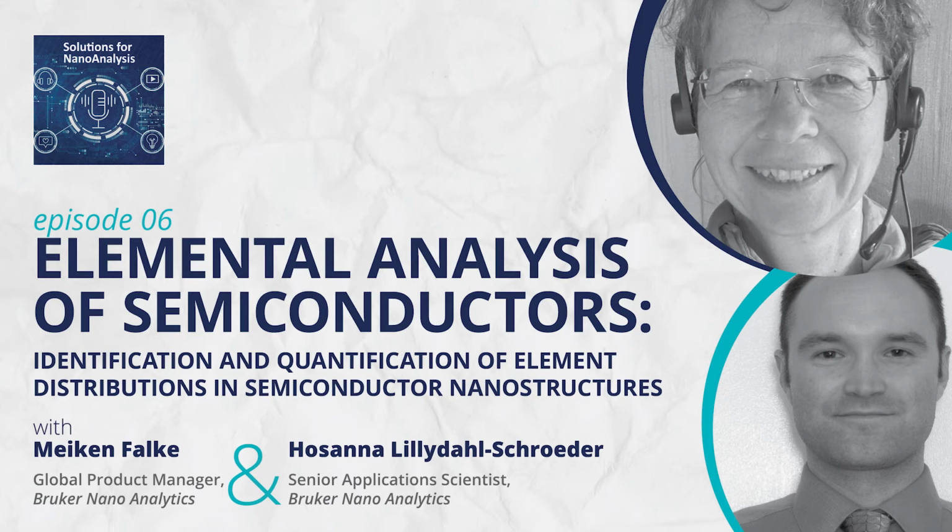So we need to be on the atomic scale that is done in TEM. But of course, on the nanometer scale or atomic scale, we only see a very small piece of our specimen, and therefore SEM or larger scale investigation is also very important. And I know that SEMs, specifically designed SEMs with specific additions of analysis, are used also to evaluate whole wafers or wafer surfaces for contamination or functionality.